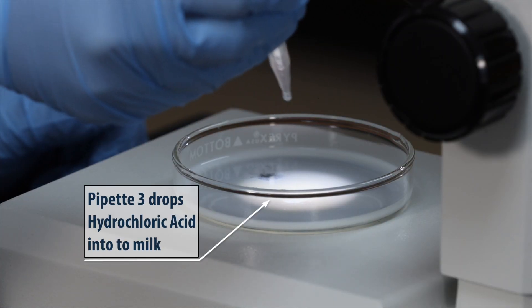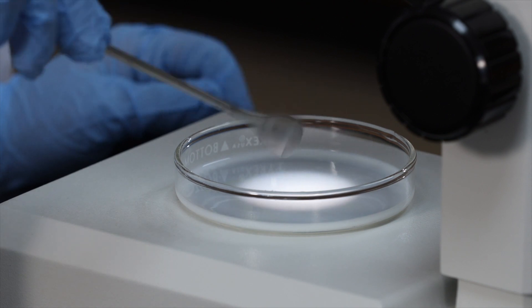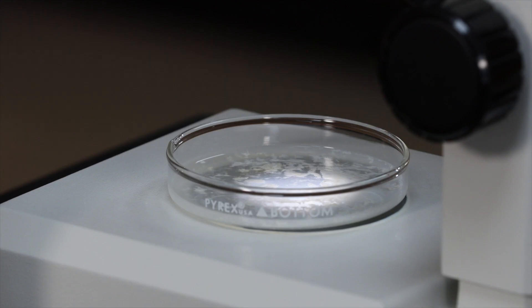Pipette three drops of hydrochloric acid to the milk and carefully mix the solution with a stirring rod. Repeat this process two more times. Soon, the pH change causes the milk to curdle.